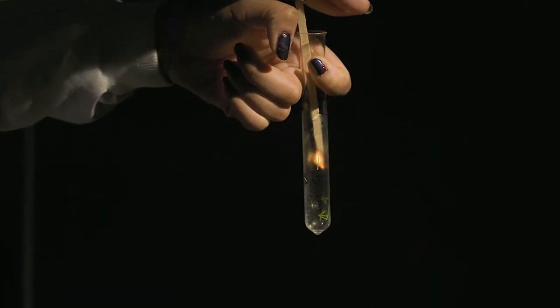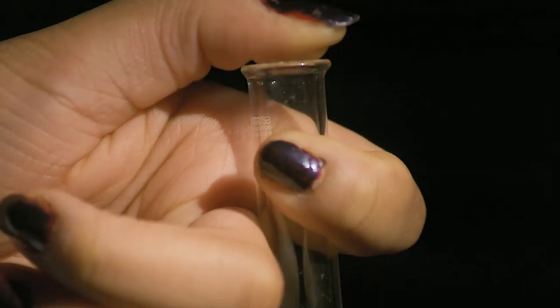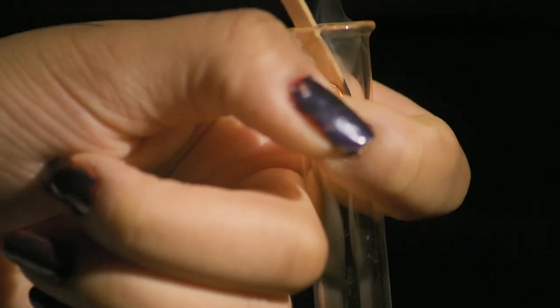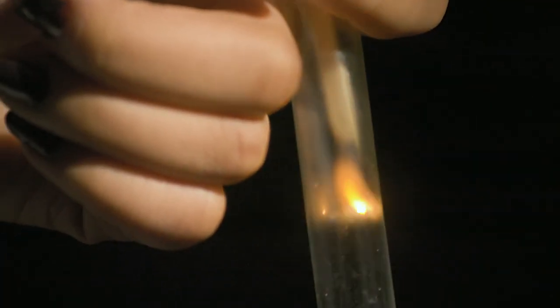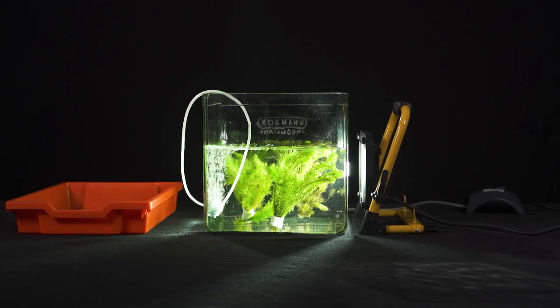There are a few things that can really make a difference to ensuring that this practical is successful for all the students in the class. Pondweed is a living organism which responds to its environment. So it's important that the pondweed is kept in conditions that mean it's photosynthesizing readily before as well as during the practical.